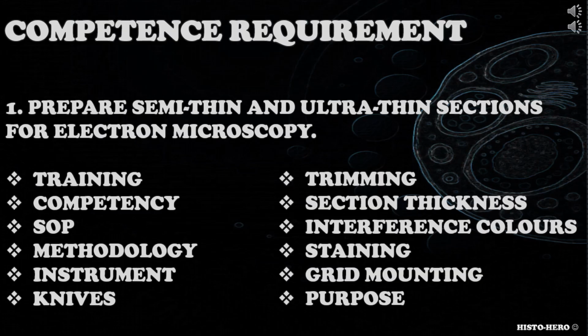When addressing this competence requirement, candidate could consider their training and competence, SOPs and methodology used, instruments used, knives, sample trimming and ultra-sectioning, section thickness, interference colors, staining and purpose of semi-thin and ultra-thin sections.